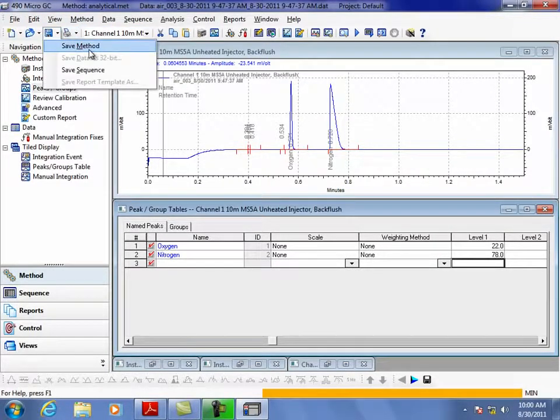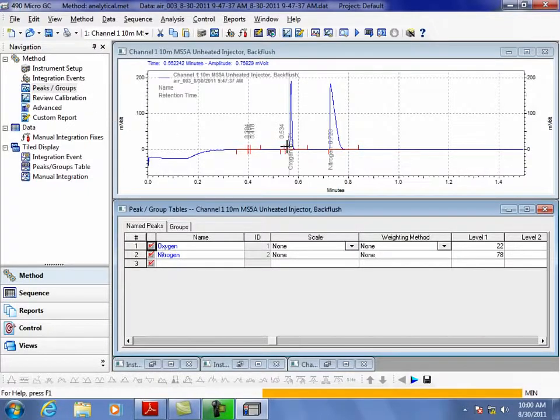And we'll say File, Save Method. Now I can calibrate the system, and it will tell me that the next time I run one, it'll calculate what this is. So I want to go in next to where Analyze is up here. There's an icon called Single Analysis Calibration. This is all here, by the way, in Analyze and Analysis Single Calibration. I just run on icons.